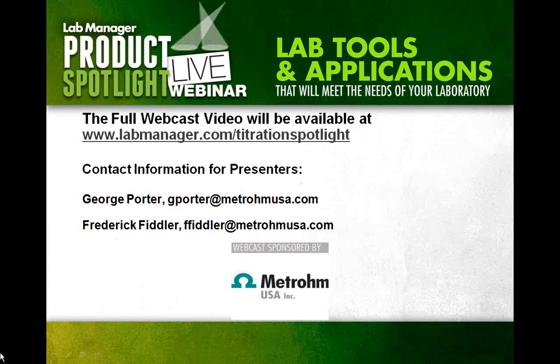Okay. And how many instruments can be connected to the software? To the Tiamo software, it's now actually unlimited would be the right answer. It's more of a human factor at that point. How many can one person run at one workstation? It's very easy to do 4, or even a few more than that, 4 or 5. Then you have a lot of people trying to crowd around one system to use it. Right.